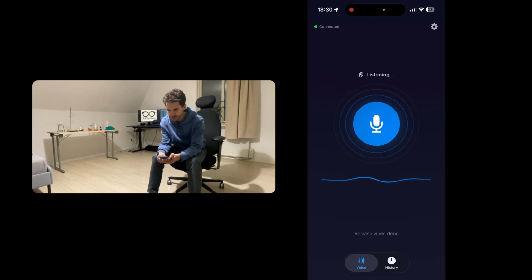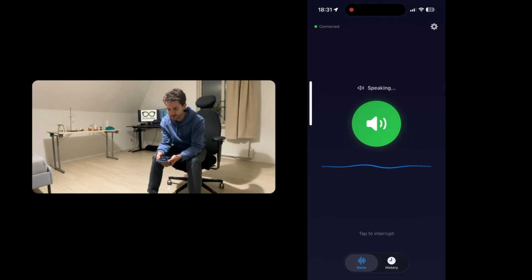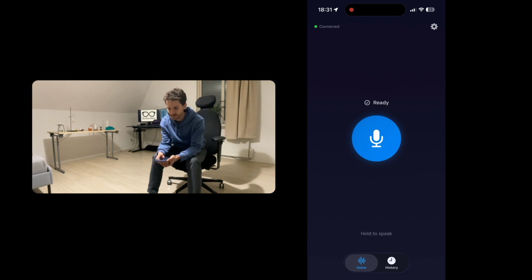Can you briefly tell me what is experiment number 1? What are we doing here? Experiment 1 is all about curcumin extraction and dosing. You're extracting the curcumin molecule from an organic phase, concentrating it, and then dosing HEK 293 cells, followed by a viability assay.